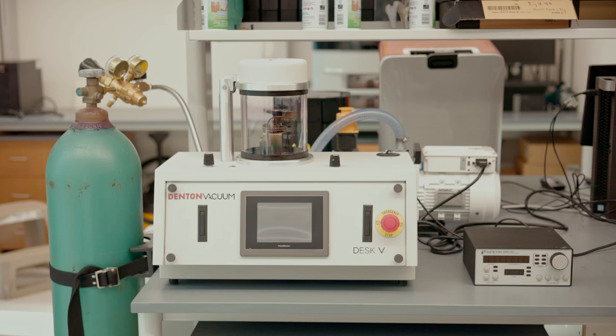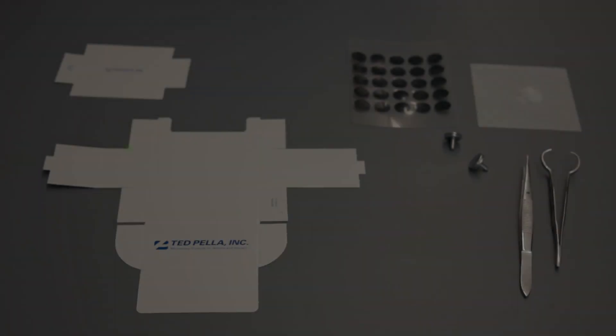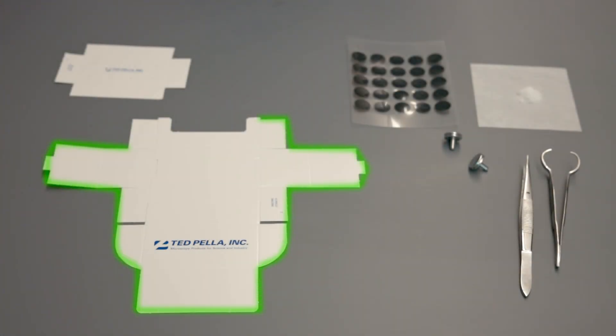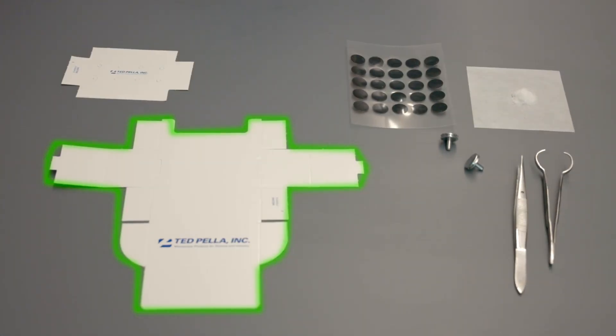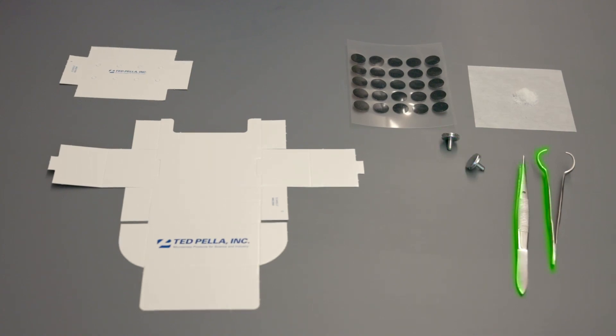The sputter coater is connected to an argon gas tank, a vacuum pump, and a thickness monitor. We need a box to help us with sample preparation and storage, the sample, carbon conductive tape, sample mounts, and a couple of tweezers.